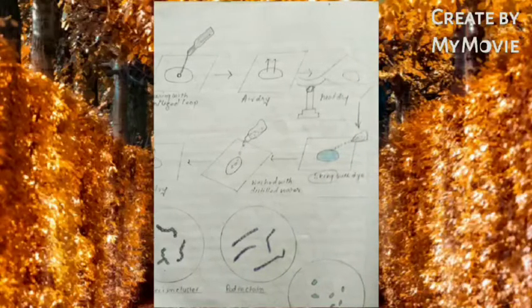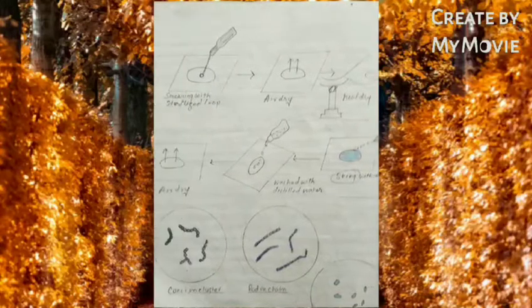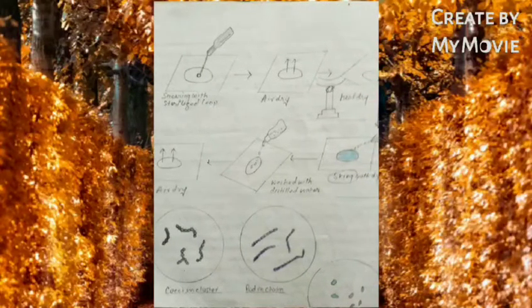For procedures and the precautions to be taken during staining, you can read as shown in the book cover.